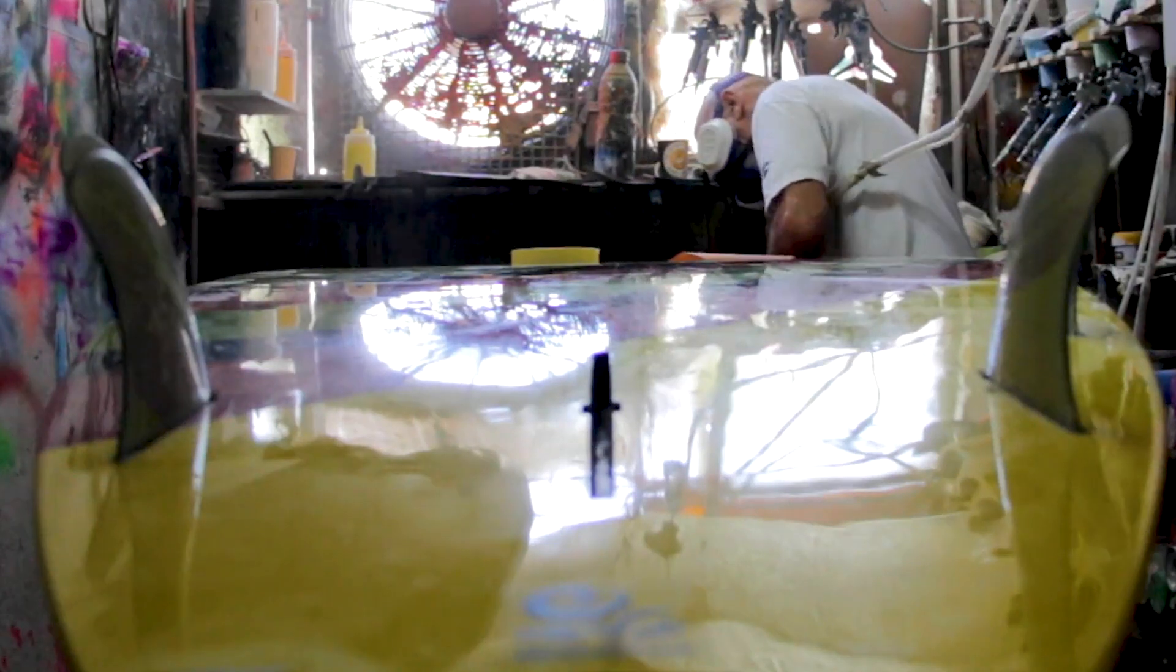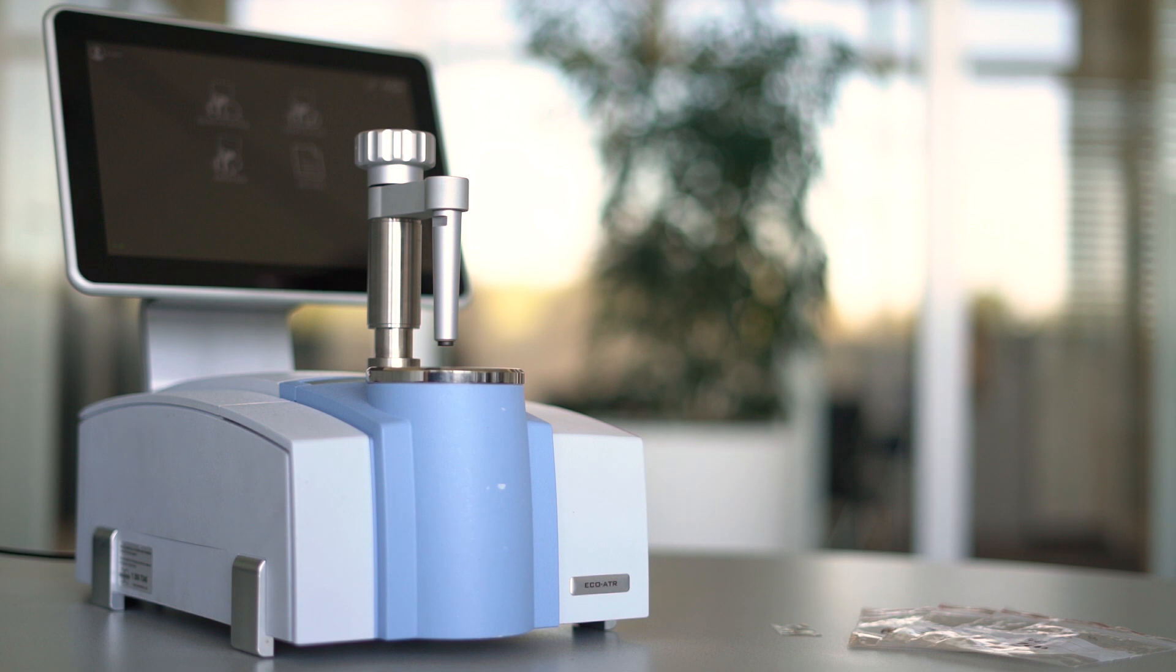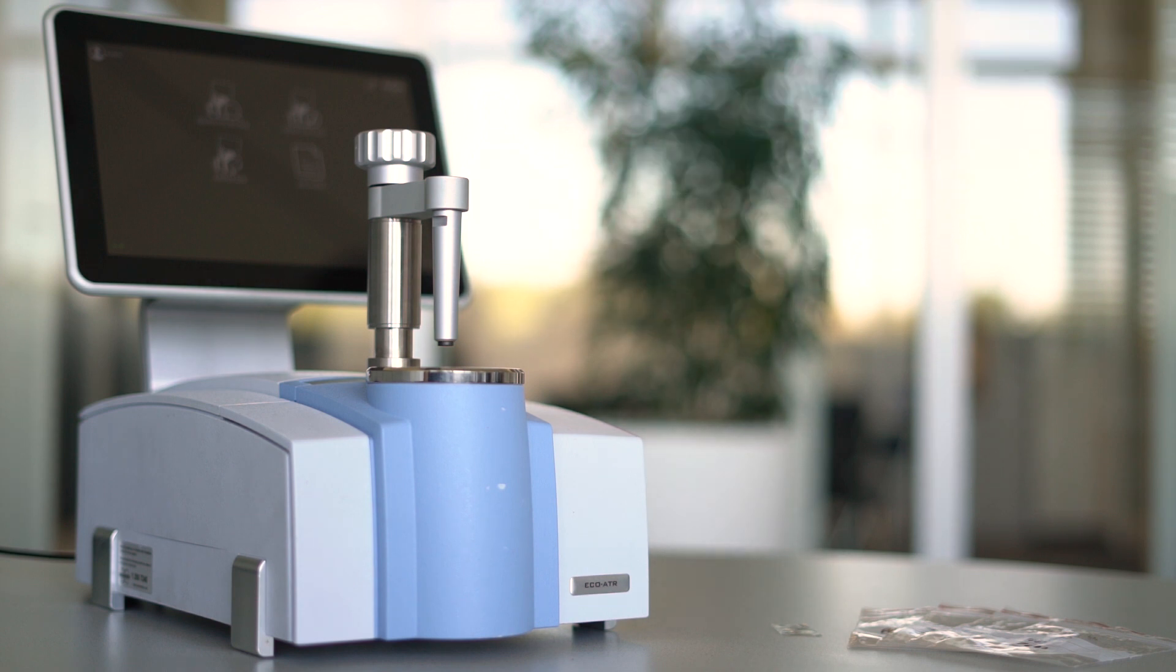To ensure that your coatings perform safely and reliably, careful quality control is vital. Infrared spectroscopy is a powerful and established analytical method and a smart choice for QC/QA for thin layers of polymers.